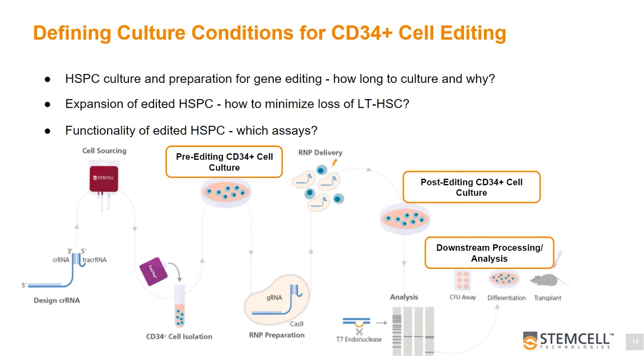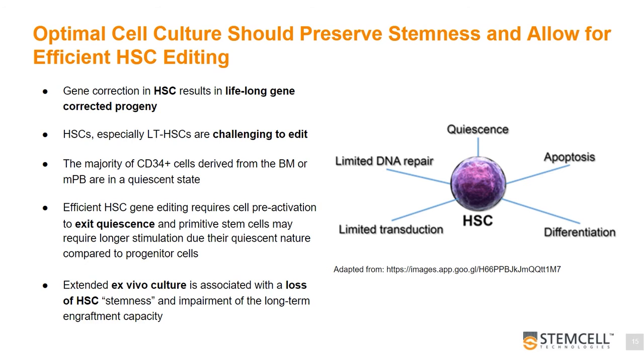editing workflow optimization. There are few important considerations in defining optimal culture conditions for CD34 cell editing, including how long to culture and why, how to minimize loss of primitive cells, and how to assess whether edited cells remain functional. A successful genome editing workflow should result in gene-corrected HSCs that are capable of generation of lifelong gene-corrected progeny.